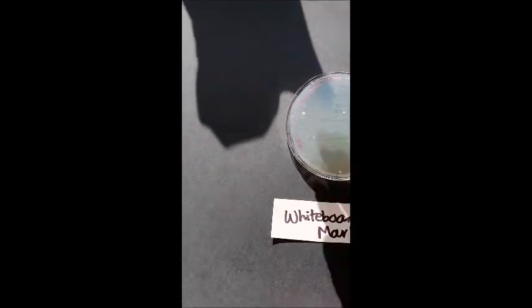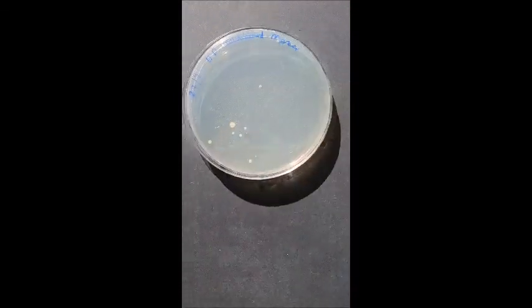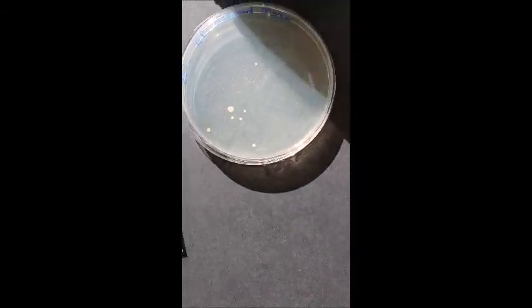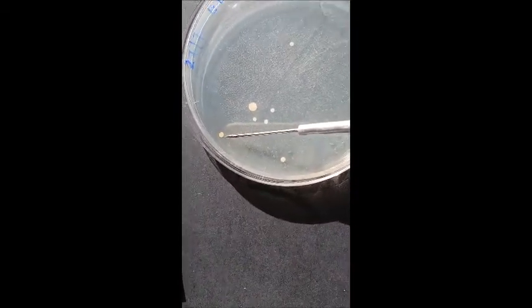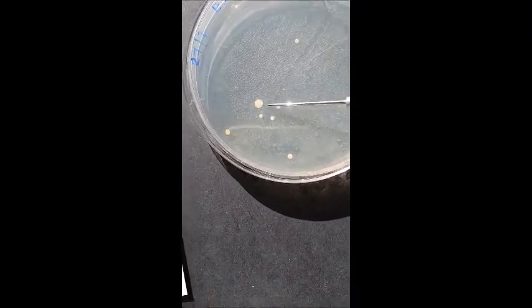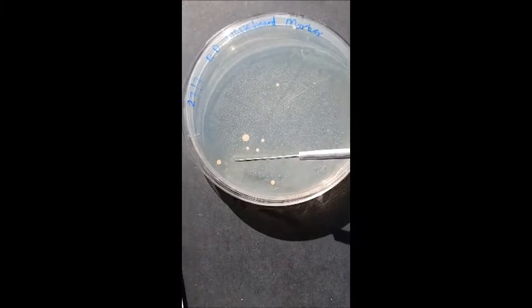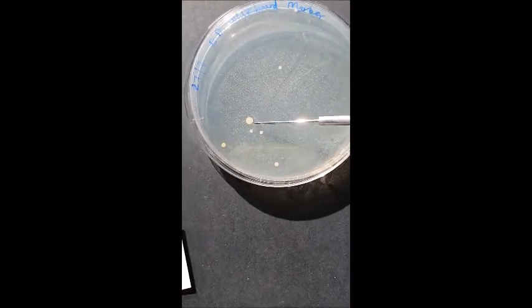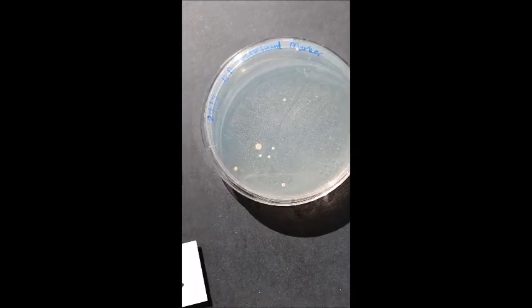And then interestingly, I'll show you the other class's whiteboard marker results. So this one, I actually think that's a different bacteria. See how that is slightly yellower compared to this white one? I think there are 2 different bacteria here. You can tell bacteria apart by the shape of the colony, which is round, and the texture. If you look at the other side, these are quite shiny.